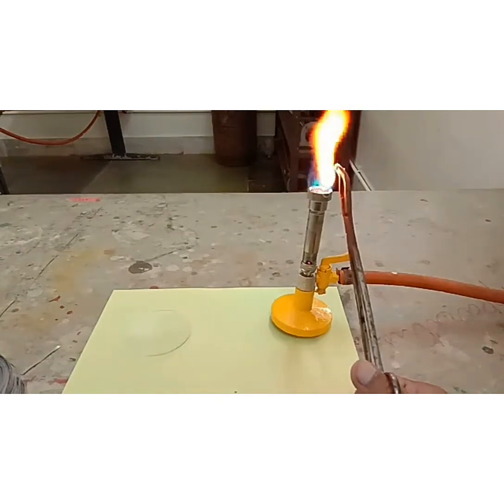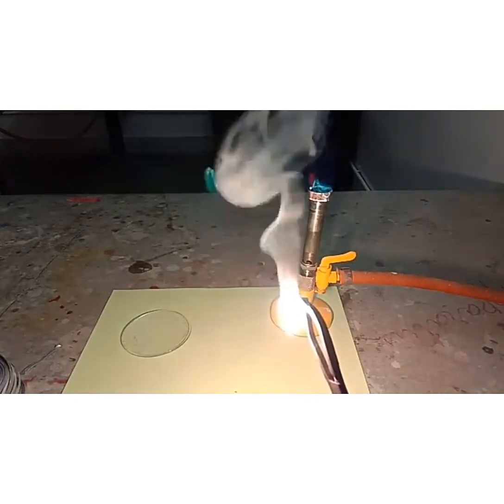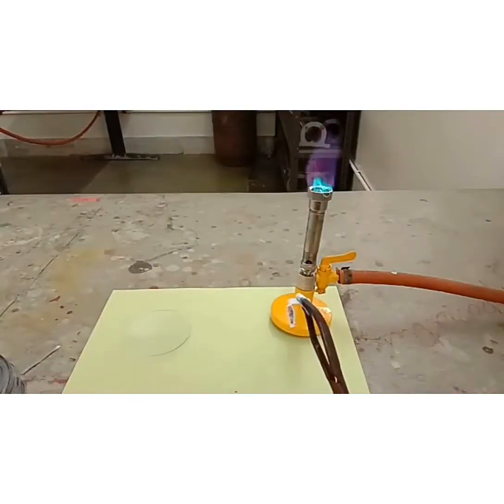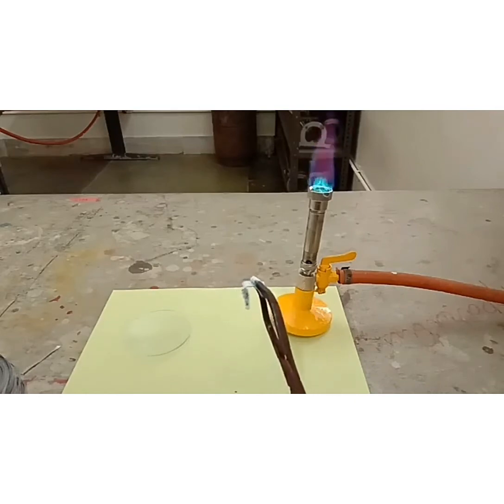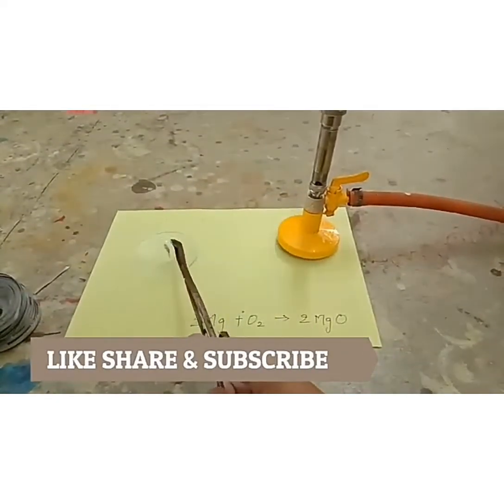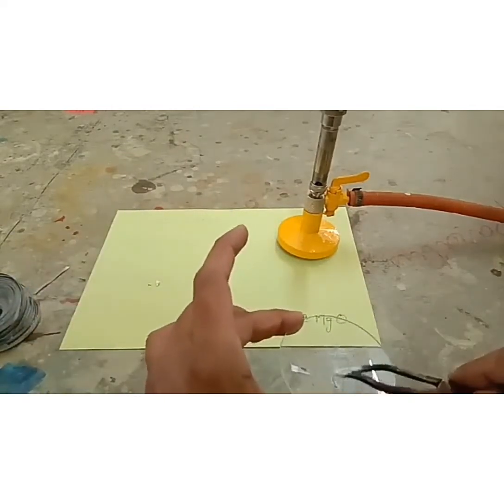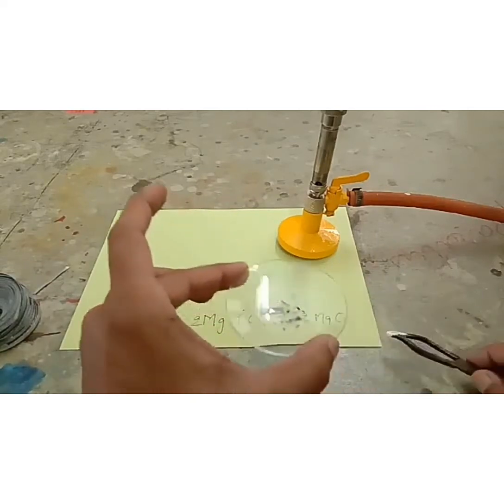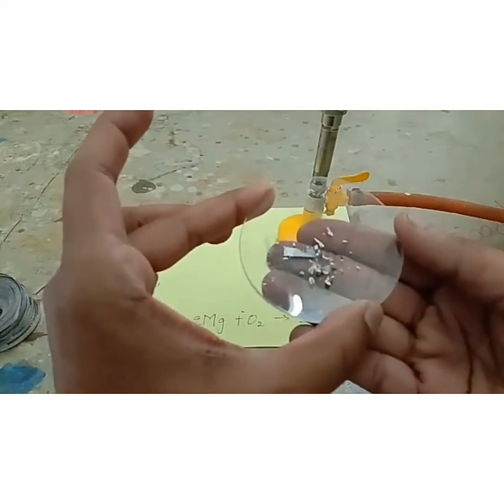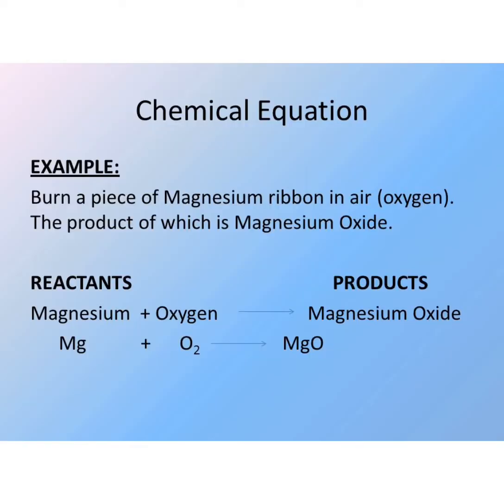As you can see, magnesium burns with a dazzling white flame. Now as the reaction is completed, you can see that this white color thing is being produced. This white color is nothing but magnesium oxide. Let's try to break it. This is white color powder. This white color powder is nothing but magnesium oxide. So as you saw, magnesium burns with dazzling white flame. Here magnesium reacts with oxygen and forms magnesium oxide.